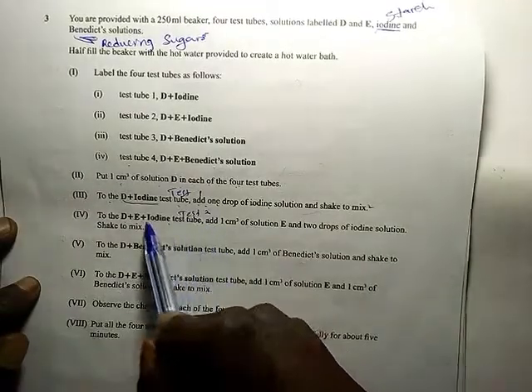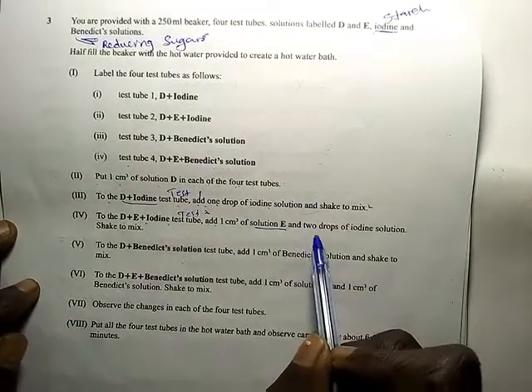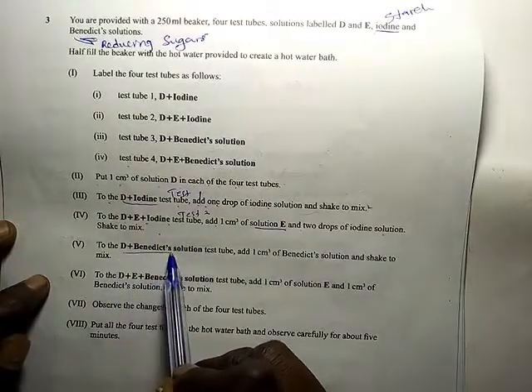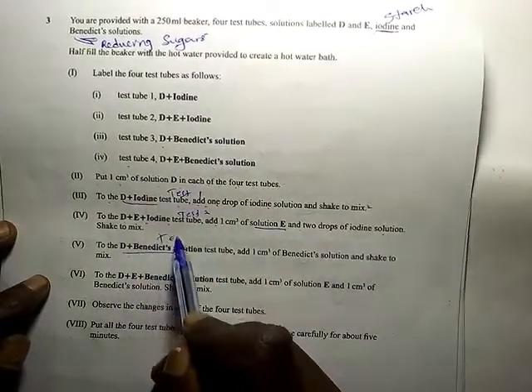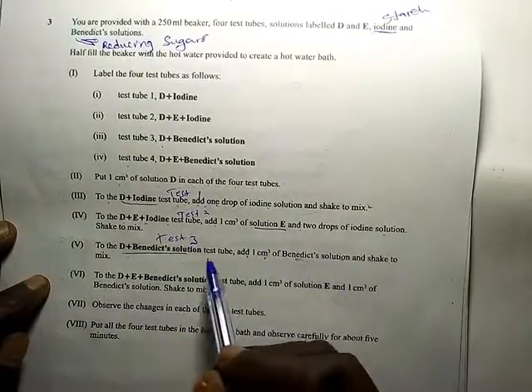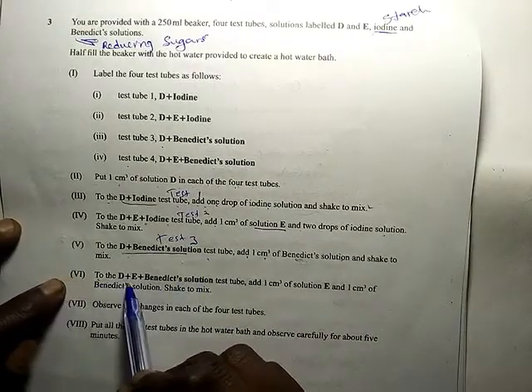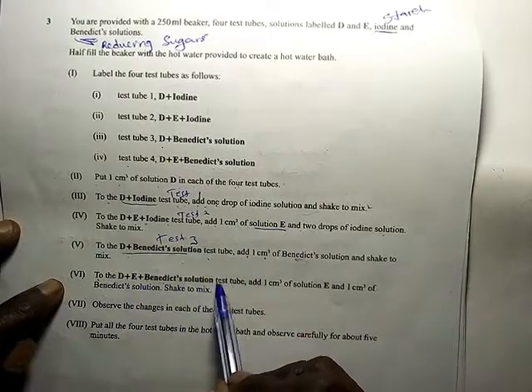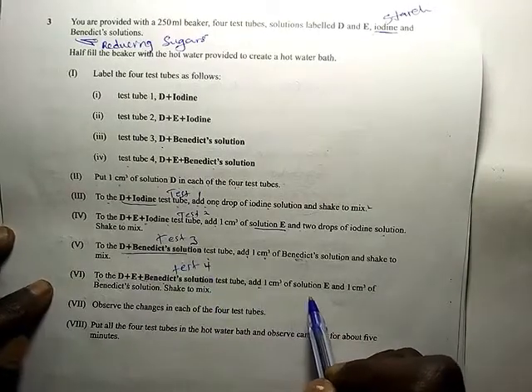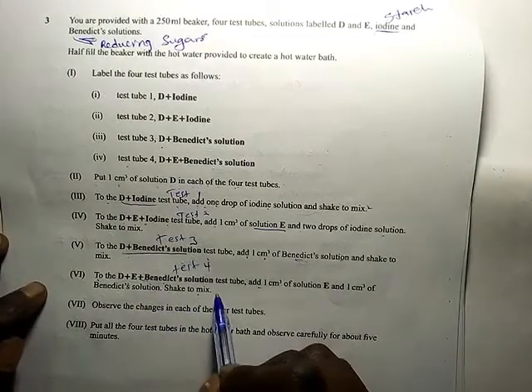this one is test tube 2, add 1 centimeter of solution E that you were provided and 2 drops of iodine and shake. To the test tube that you labeled D plus Benedict, that is test tube 3, add 1 centimeter of Benedict solution, shake to mix. Now, in 4, to the D plus E test tube, that is test tube 4, add 1 centimeter of solution E and 1 centimeter cubed of Benedict solution, shake to mix.